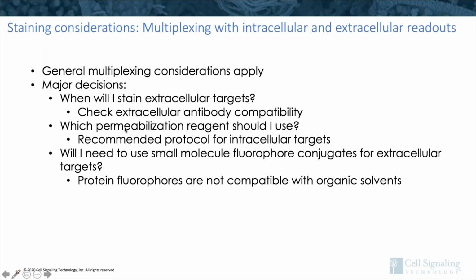You also want to consider which permeabilization reagent to use, and typically we just recommend going with whatever protocol the manufacturer suggests. This final point really goes along with the first, deciding whether you'll need to use a small molecule fluor versus whether it's okay to use a small molecule or a protein-based fluor on your extracellular targets. Just keep in mind that protein fluorophores can't be carried through an organic solvent.